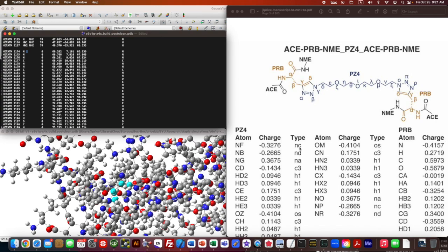It's not too bad, but so this atom is the alpha. Alpha, beta, gamma, delta. It makes sense except for that one. And again, if I called it Na, PyMOL later on was going to get confused. Okay, I just wanted to explain.